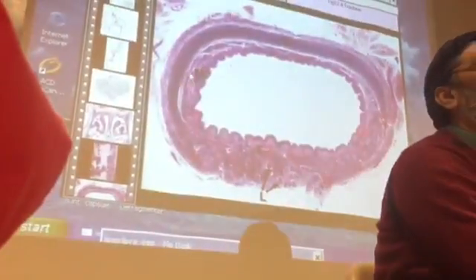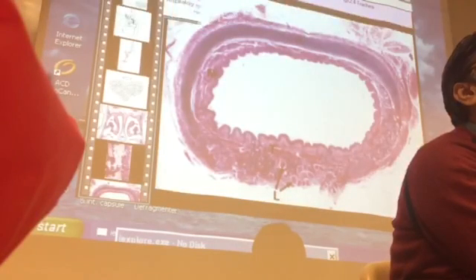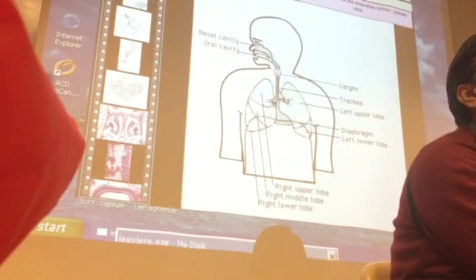And this is the kind of epithelium present in the nasal cavity. And when we come to the trachea, let me go to the trachea here. This trachea has a structure like this. It is a rounded, tube-like structure. And here you can see that the trachea has rings.